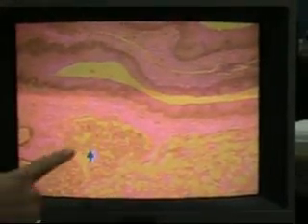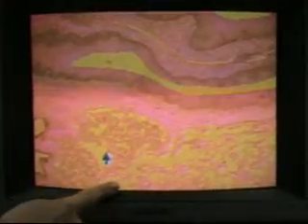You see all this. So this is part of the tonsil. And if we just move around here, you see it's all the way around. It is oral epithelium. The other easy way to recognize them, what do you see here? These are salivary glands. Okay, so down here and some fat tissue.